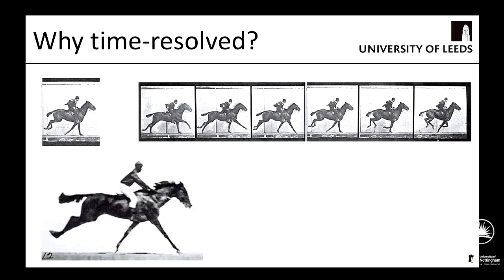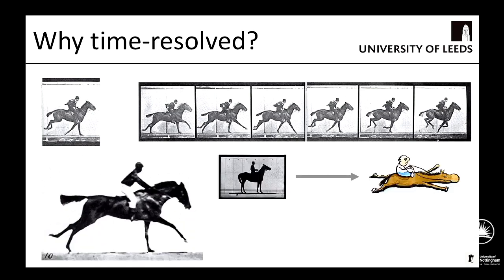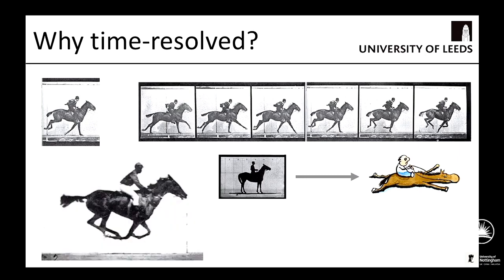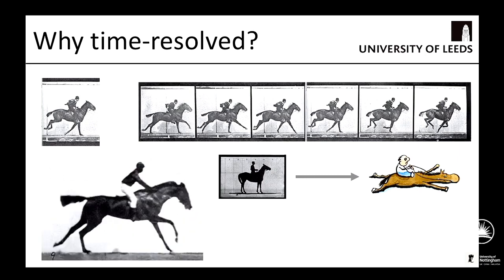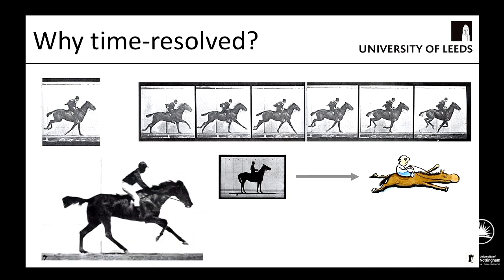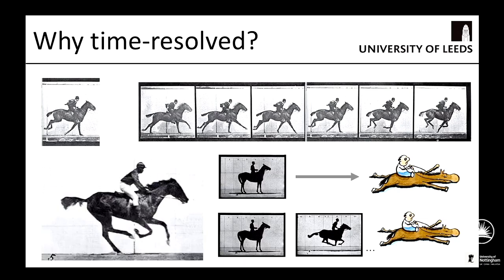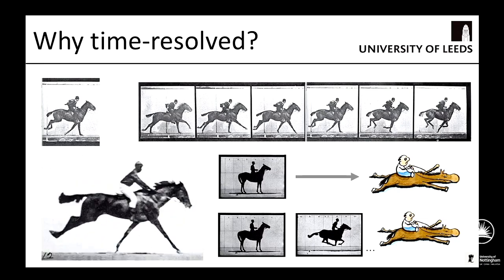And one of the big challenges with some of the systems we're looking at the moment is that, put simply, the reaction ends before we get a chance to study it. So with conventional approaches, we're looking at, in vitrification, about 8 seconds to make a grid. Most reactions have gone to completeness within 8 seconds. So how do we capture those intermediate steps before we reach the end point of the reaction?